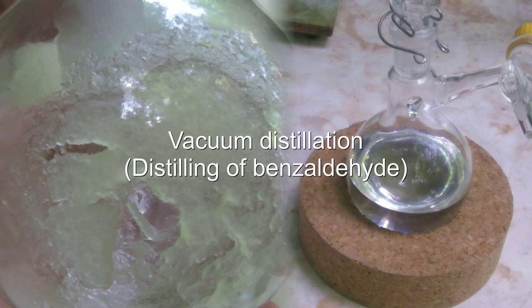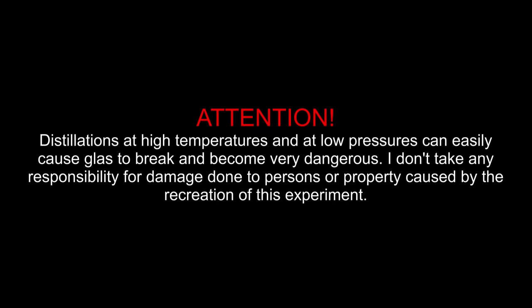Distilling off benzaldehyde. Attention! Distillations at high temperatures and at low pressures can easily cause glass to break and become very dangerous. I don't take any responsibility for damage done to persons or property caused by the recreation of this experiment.